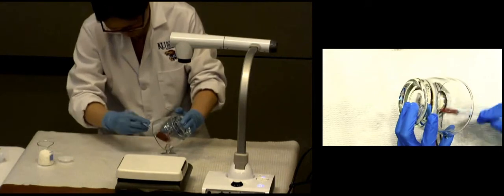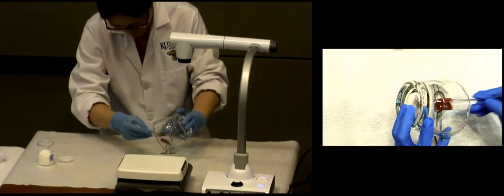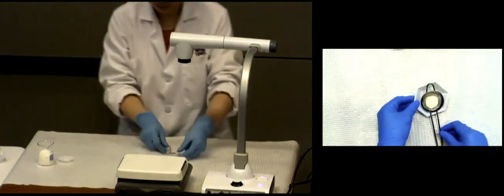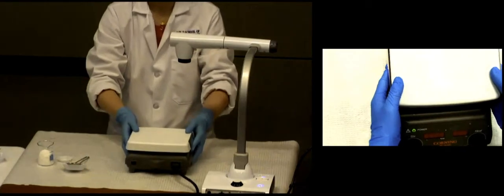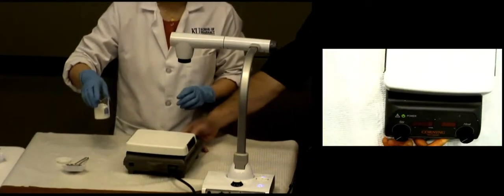Is a molten base really, really thin, or is it still a little thick? Still a little thick. I mean, it's not super thin like water. It's molten, it's liquefied, but it's not really thin. Powder would very easily clump together if you just dump it in all at once. So we want to disperse the powder. We don't want it clumped. We don't want uneven concentration throughout. So we want to make sure that it stays relatively even.